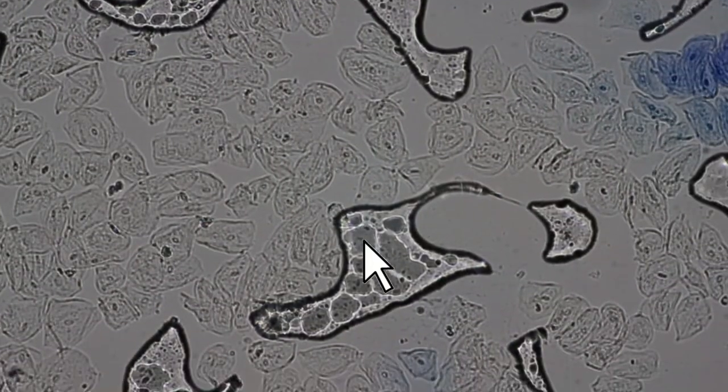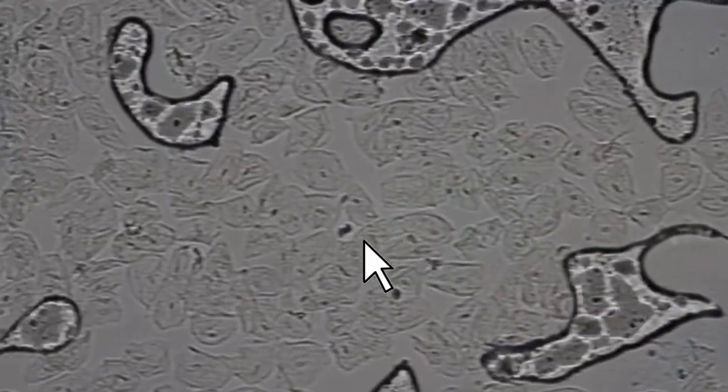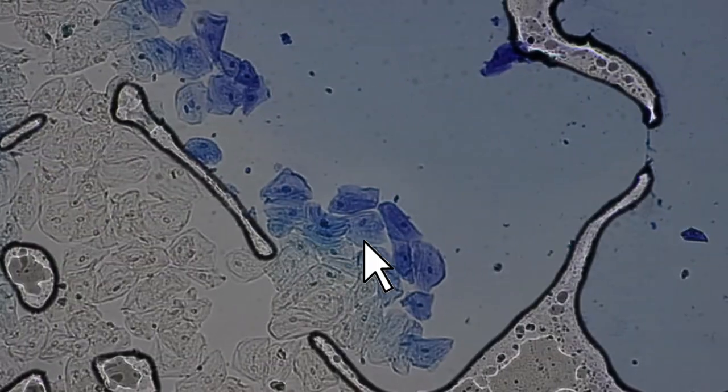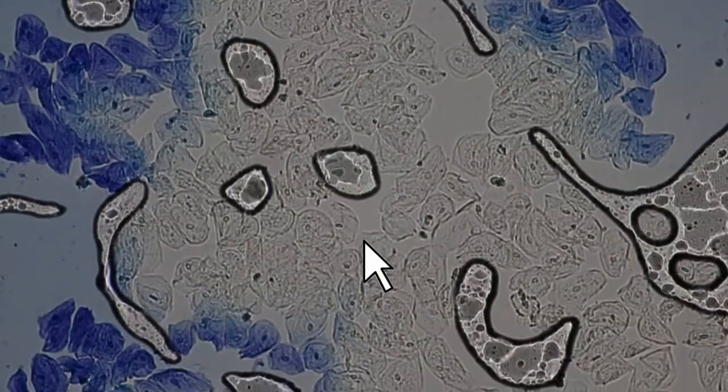Because otherwise, there must be liquid in here, right? There is definitely liquid in here in the middle, because otherwise there wouldn't be any air bubbles here. And otherwise the stain itself, the solution itself, would have immediately gone in. Hmm. Interesting.